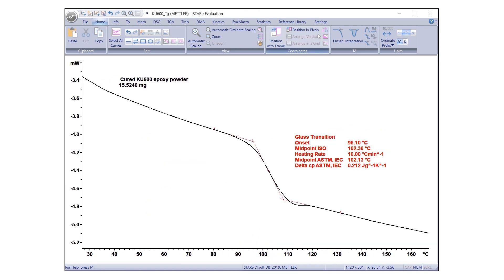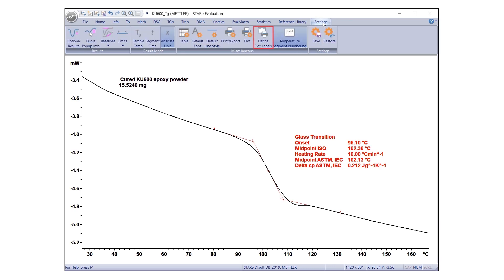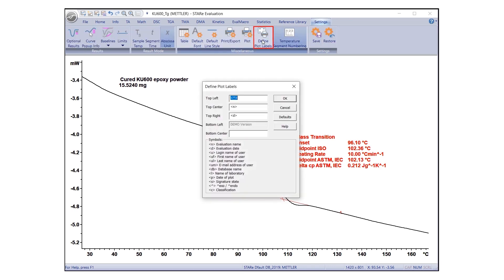Once properly laid out using the editing functions, your STAR-E evaluation is ready to be exported or printed. First, define which plot labels should be included in the final plot diagram or printout. Under Settings, click Define Plot Labels. The Define Plot Labels dialog box will appear with a list of labels and different positioning options.